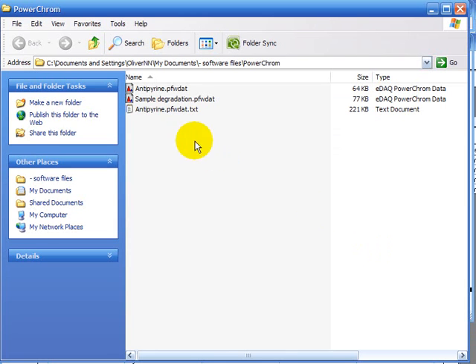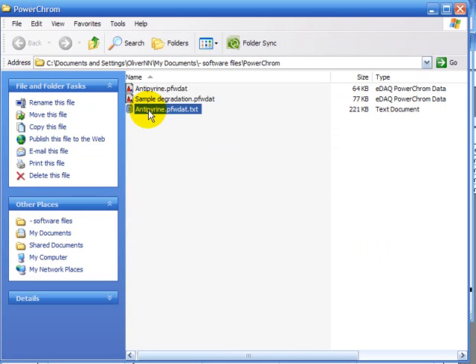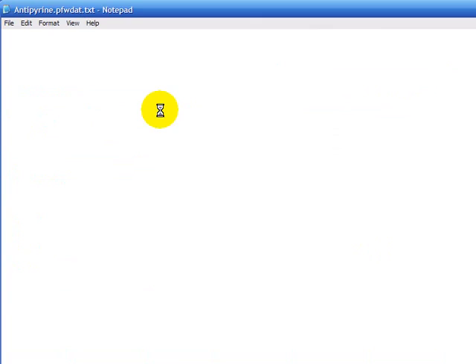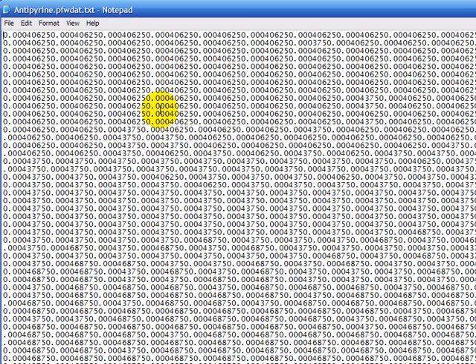If I go and find that file, it's here. It's a .txt document. If I double click to open you'll see it's lots of numbers there.